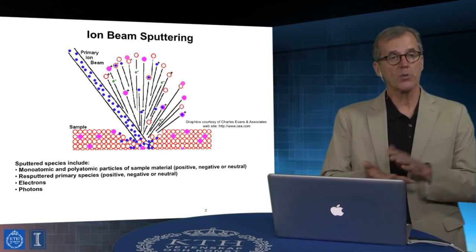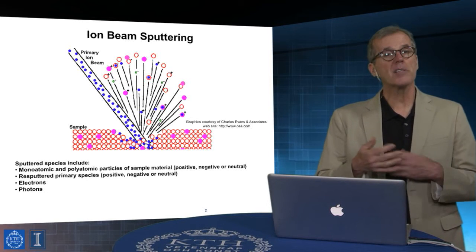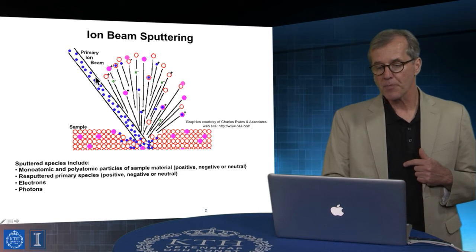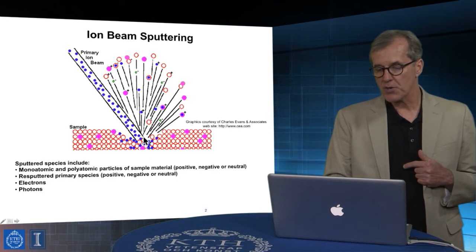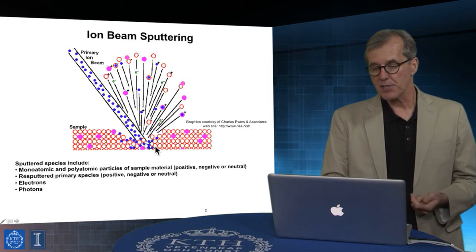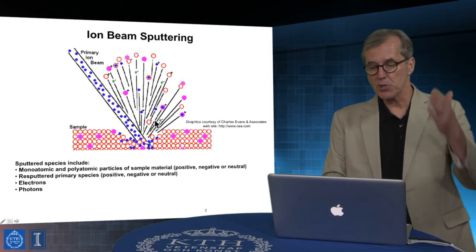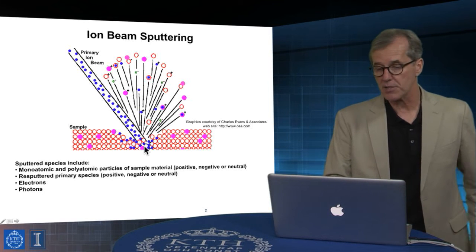This ion milling also induces ion-elicited mixing that will actually jumble compositions. We also inject matter. So even if we have argon ions impinging on a sample, these energies are sufficient to actually inject the argon atoms into the sample, where they will be entrained, basically being unable to desorb back into the gas phase because they've actually been injected into the solid lattice of the material.